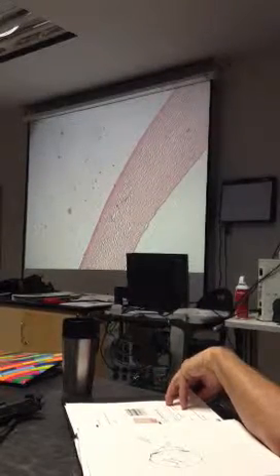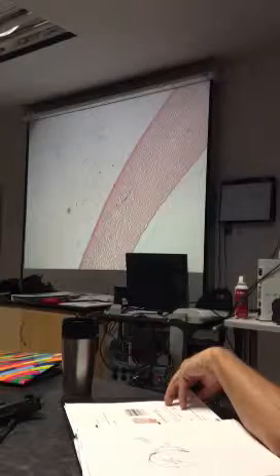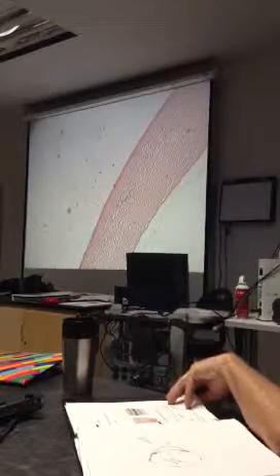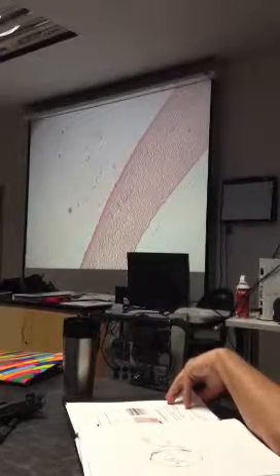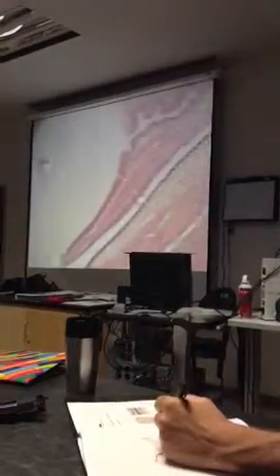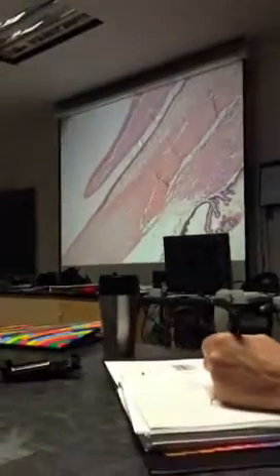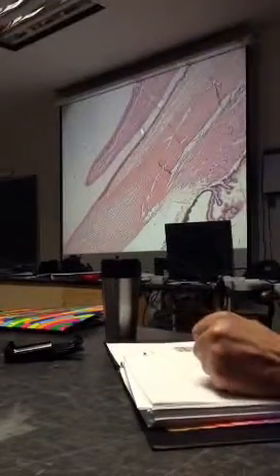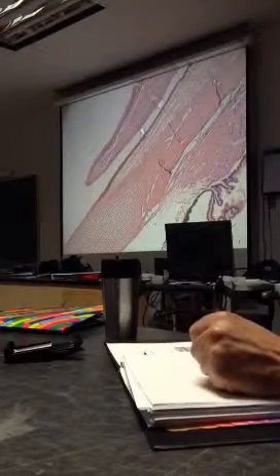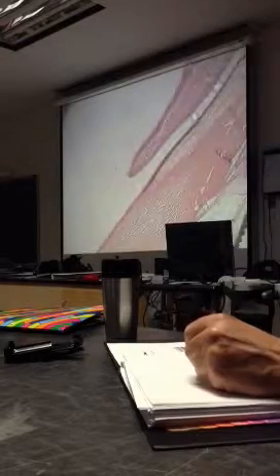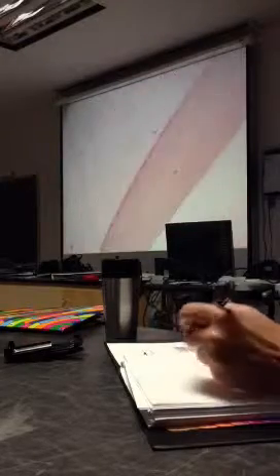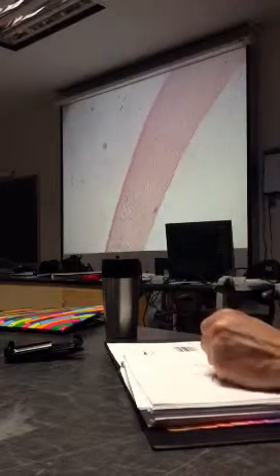What is this structure up here, out in front of the eye? The cornea. Yes, that's the cornea. And this up here — some of you are asking what's this thing — this is the eyelid coming down. We didn't focus on the eyelid much, so we're not going to pay too much attention to that. Here's the cornea.